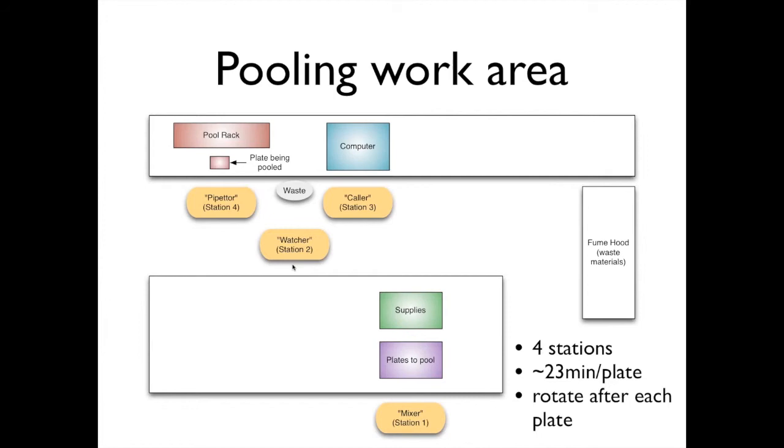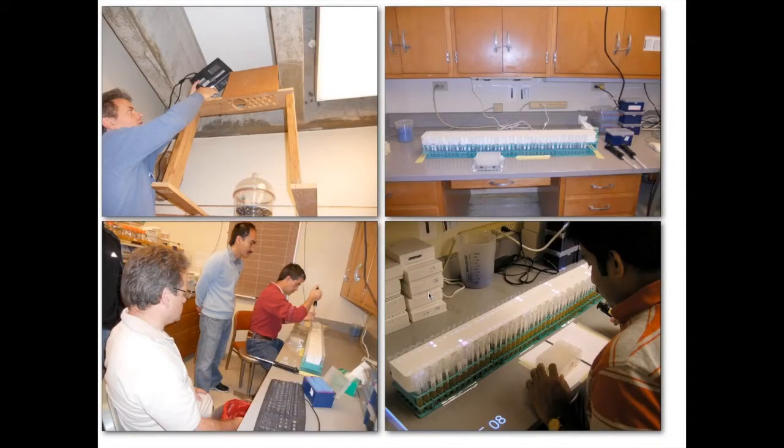So it takes about 23 minutes per plate for a 96-well plate, which is enough for one person to do a plate, then that person swaps out and we advance through the rotation. This is a four-person rotation. So this is our setup.